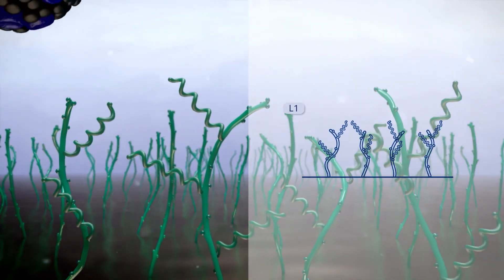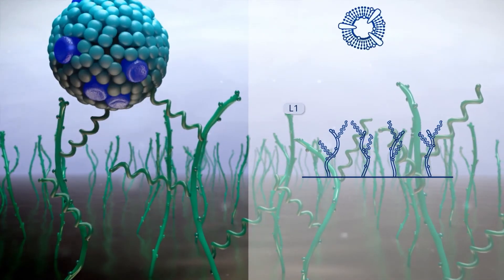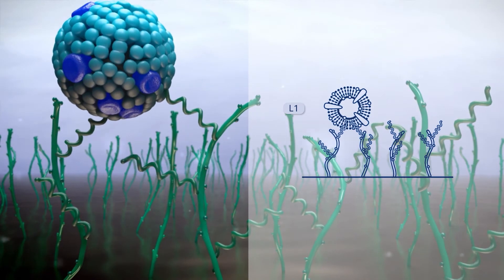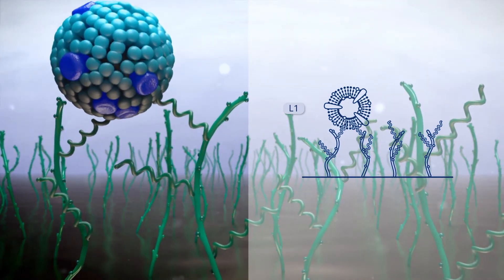For hydrophobic ligand and membrane studies, intact vesicles are immobilized directly to the L1 chip, which contains lipophilic groups.